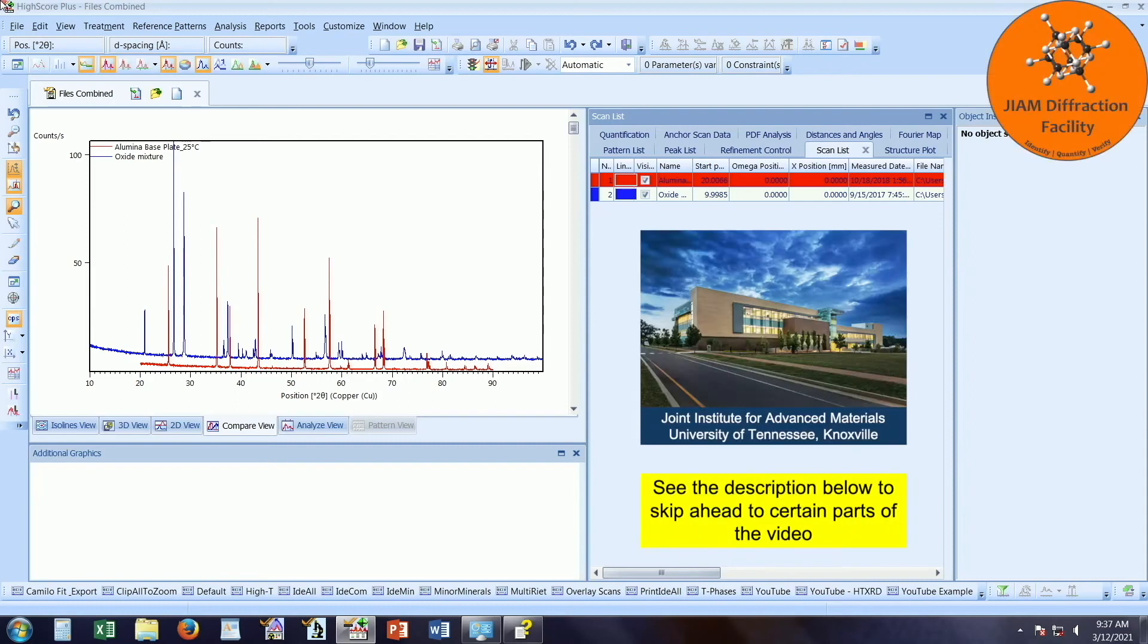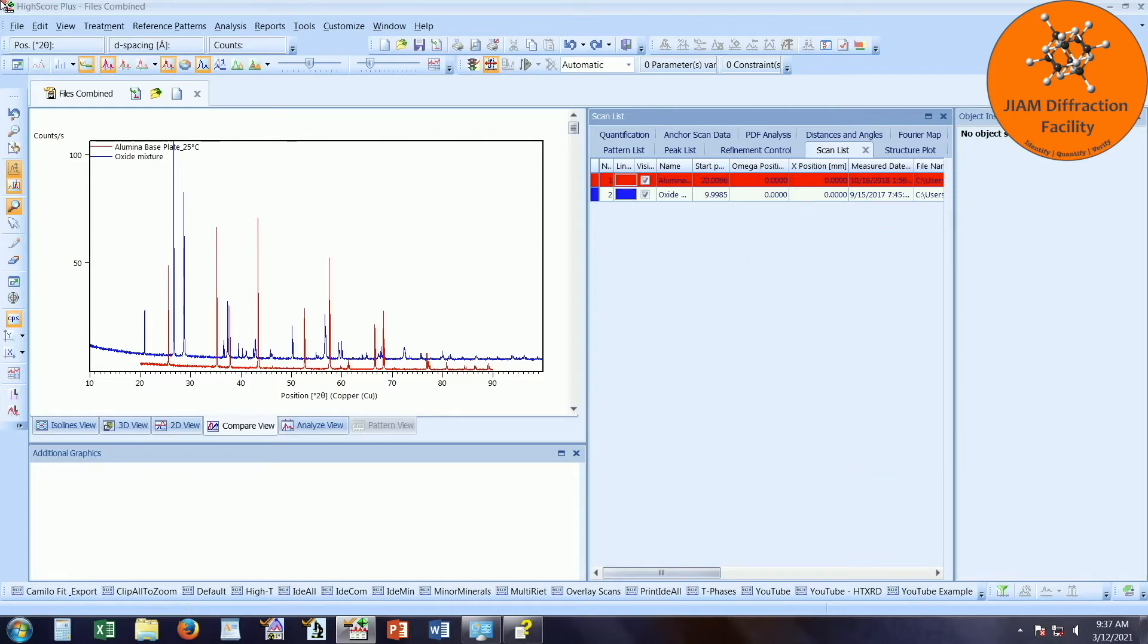Hello, my name is Michael Kaler and I am the lab manager of the JIAM Diffraction Facility located at the University of Tennessee, Knoxville. This video will show you how to set up a batch process to perform background determination, a peak search, and search match all with the click of one button.